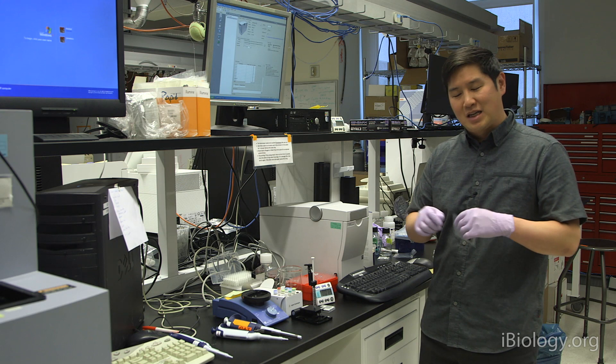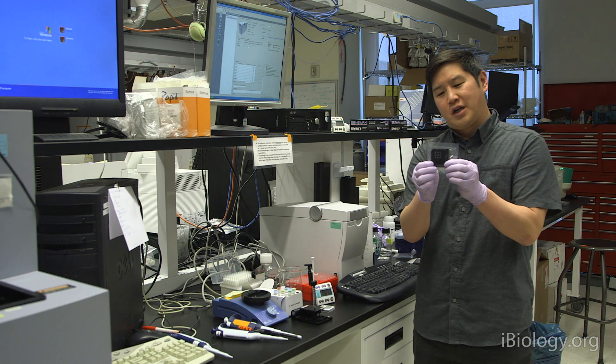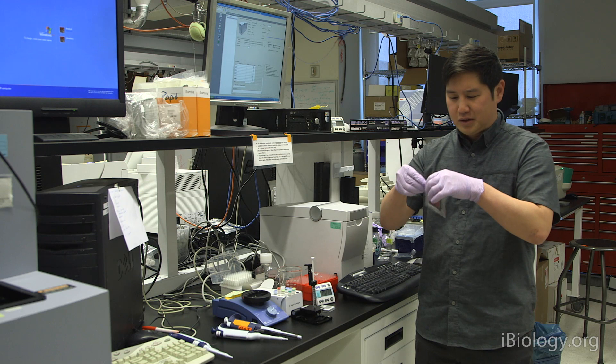This is the Bioanalyzer. Essentially, the system works by capillary electrophoresis, but instead of running samples through a long, thin capillary, all the separation occurs on these microfluidic chips over here.